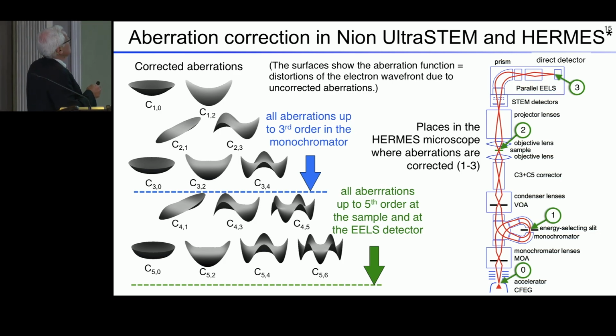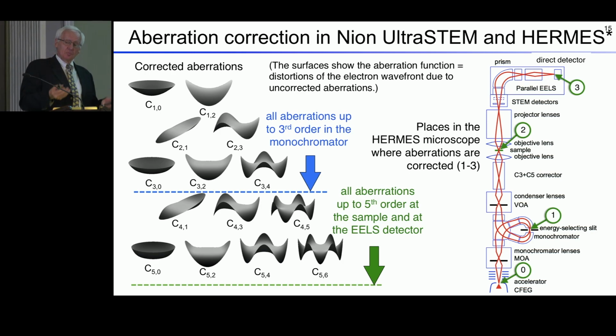So they all correspond to different shapes. The astigmatisms all have this kind of high modulation azimuthally as you go around. There are different powers for the radius. So this is a 2nd order parabola, this is a 4th order parabola, this is a 6th order parabola. So they're all somewhat related, and you can use this one and this one to counteract this one a little bit. And the computer does it all.